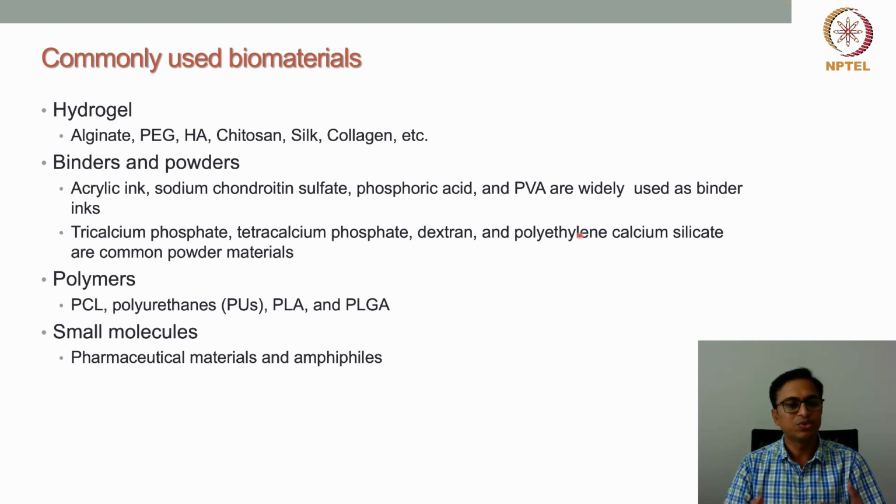But when we use an aqueous solvent, then we need to take care of how these polymers can get solidified again, so that we can make the structure. To improve the stability of the structures, we need to use one or another of the solidification strategies that we have discussed in the earlier slide.